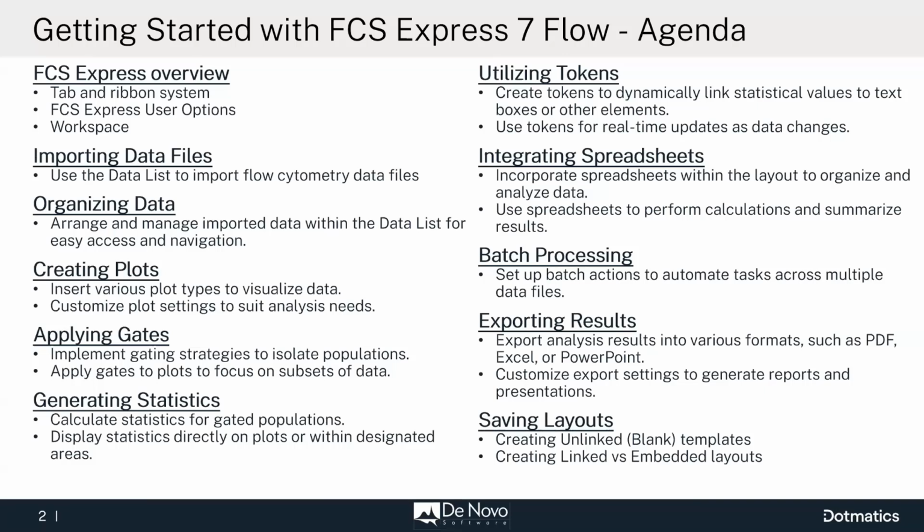All of our statistics and information about our data is shown in something called a token. And so we'll talk about tokens a little bit, how to use them in your layout and how they will update in real time as you change your data. One of the really nice things is spreadsheets. So we'll talk about how to use those, how to bring those within your layout in order to organize your data, and how we can use those to perform calculations.